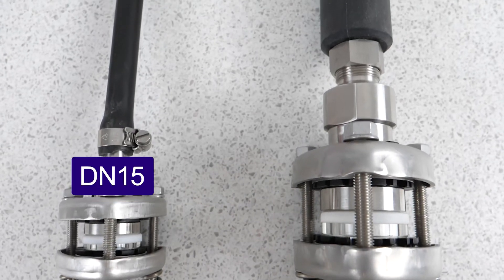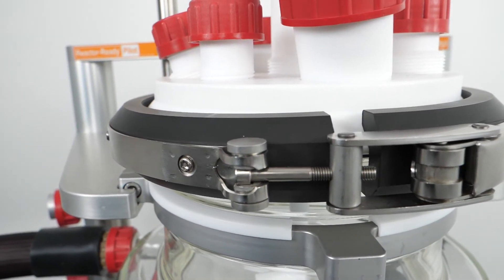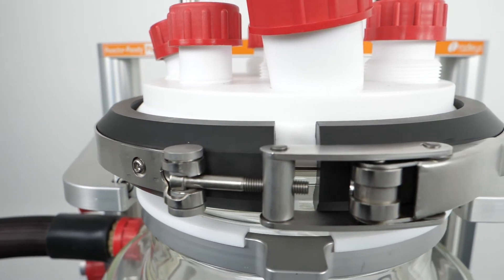Draining and replacing the heat transfer fluid and the use of traditional couplings often means that the jacketed lab reactor systems are rarely, if ever, dismantled.